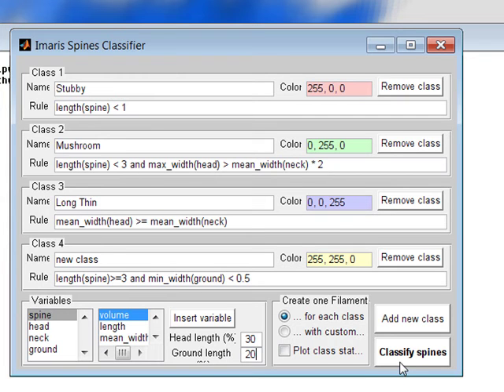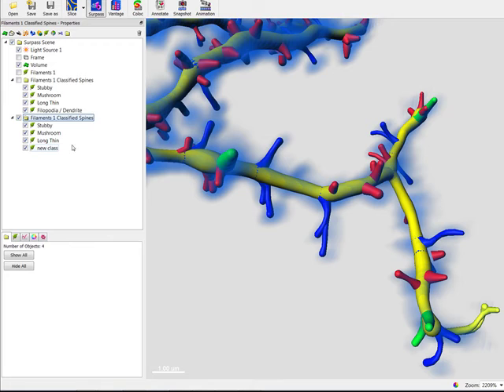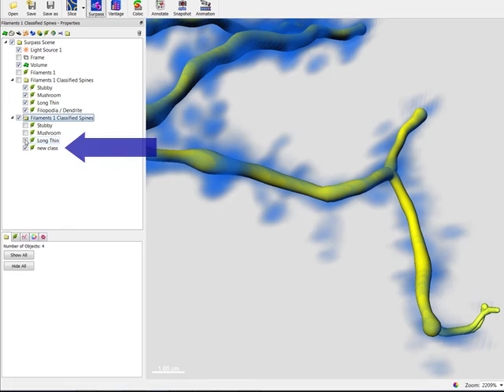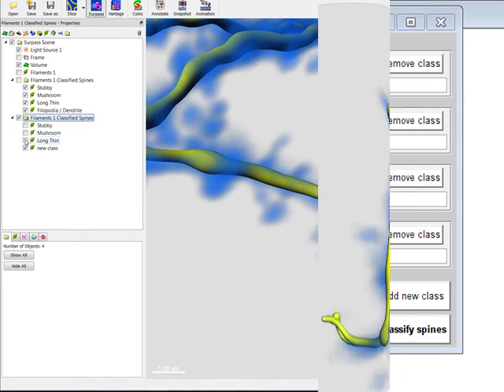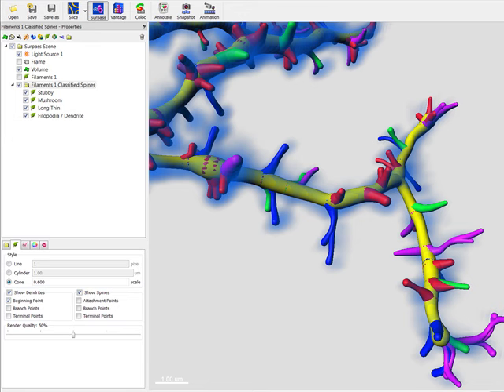The new rules will be applied when the extension is executed. The newly classified groups of spines are displayed, and in the surpass tree, the new filaments object group is created. Under the Create one filament option, you can select the different output options. The option Create one filament object for each class produces a new multi-filament surpass group and differently coloured spines in the viewing area.